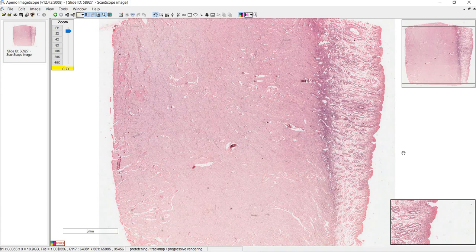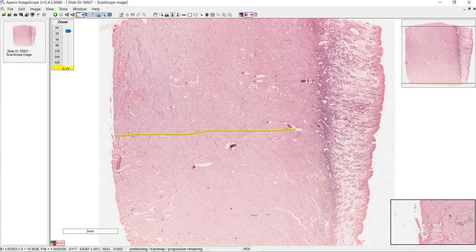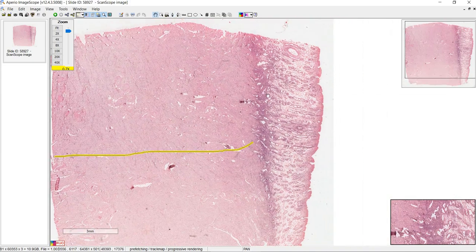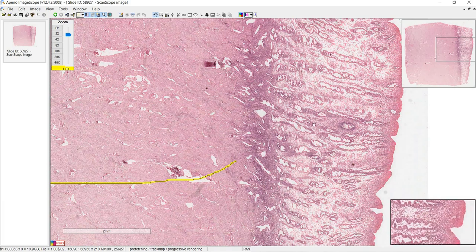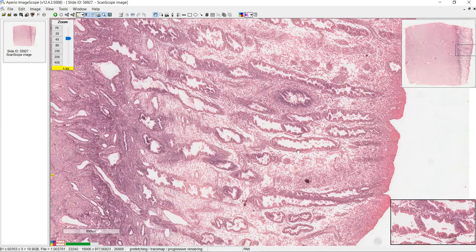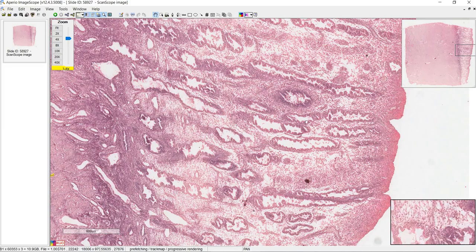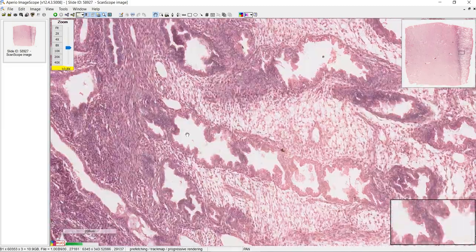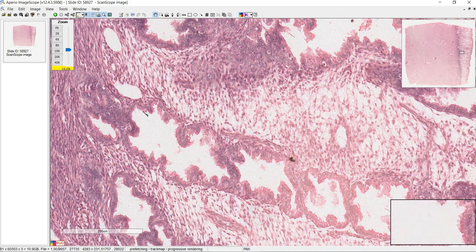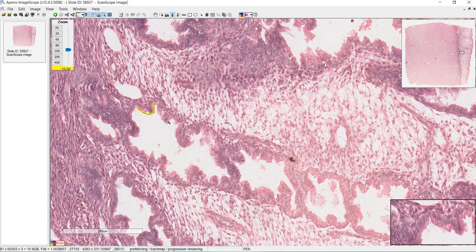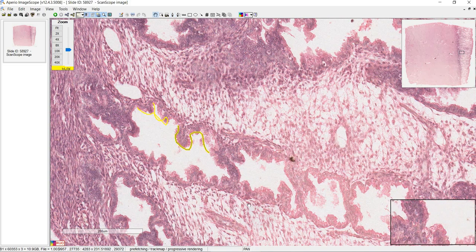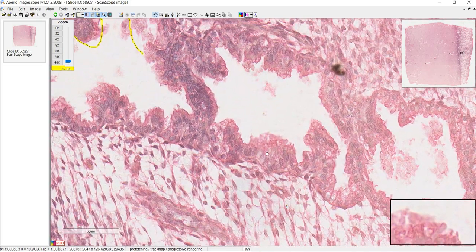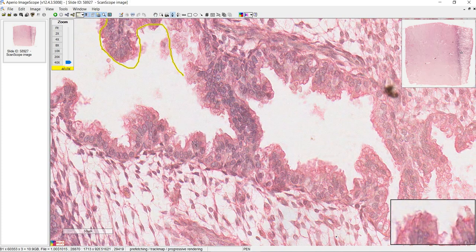Here's a slide of the uterus in the secretory phase. To review the layers: we have lots of myometrium, this darker purple area is the stratum basalis, and beyond that we have the stratum functionalis. We know this is the secretory phase because of the shape of the glands — whereas before the glands were smooth, now you see what's called a corkscrew shape, going back and forth. To confirm it's a uterine gland, look at the epithelium — these are columnar cells.